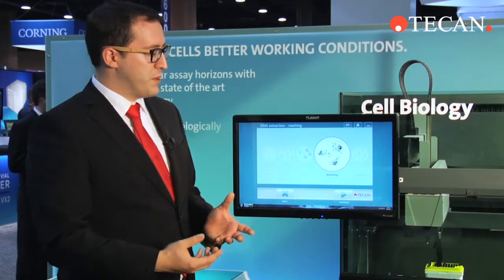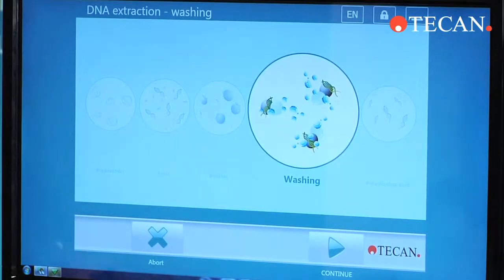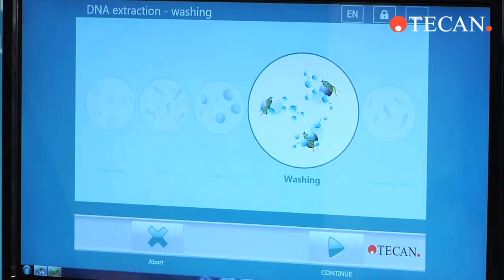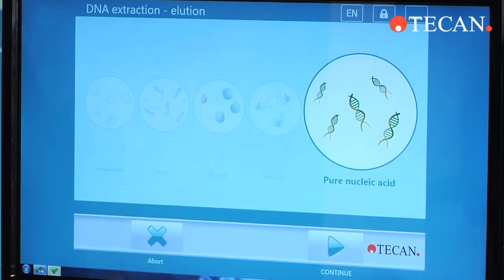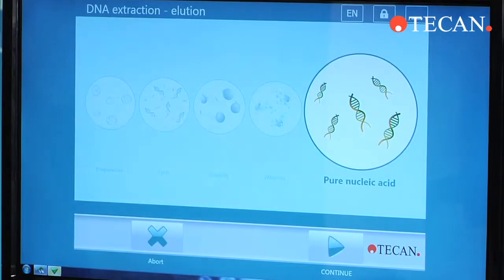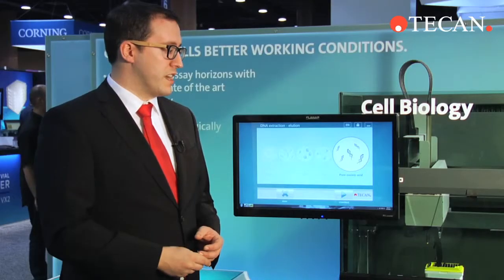Here we have an example of simple pictures based on nucleic acid purification, but it would be very easy to put in any picture you want and show that to the user while the instrument is running.